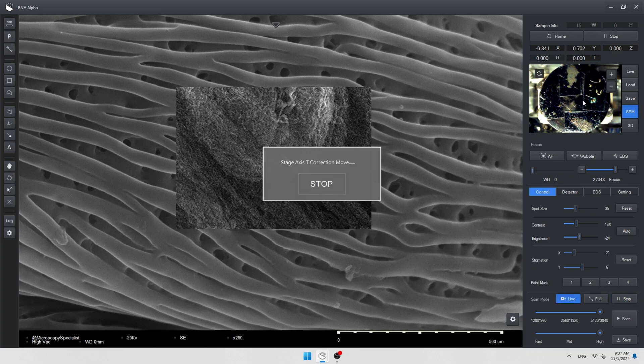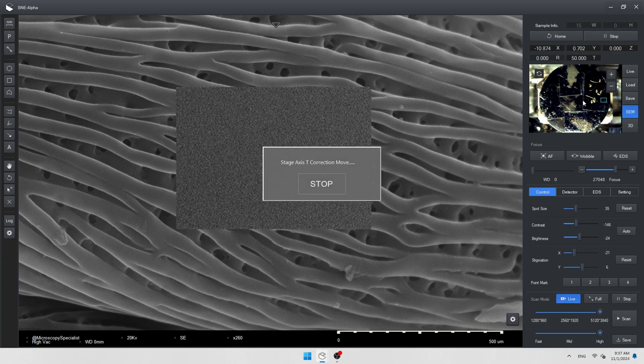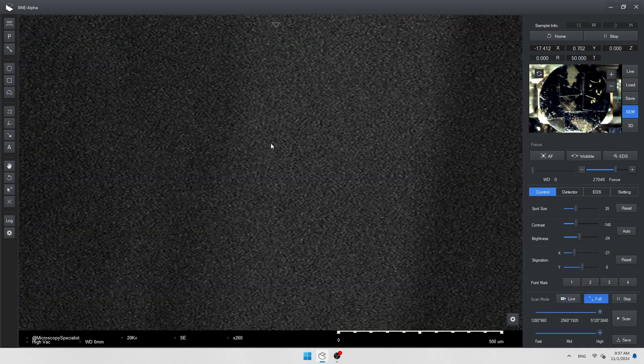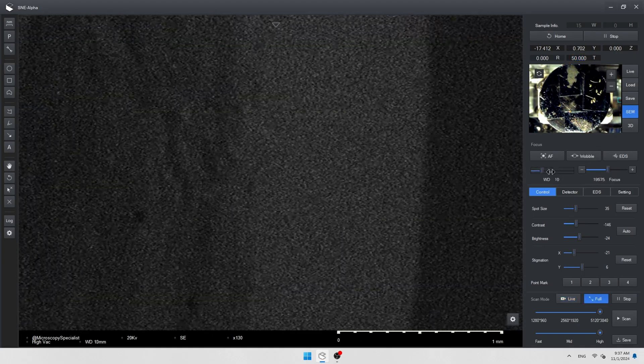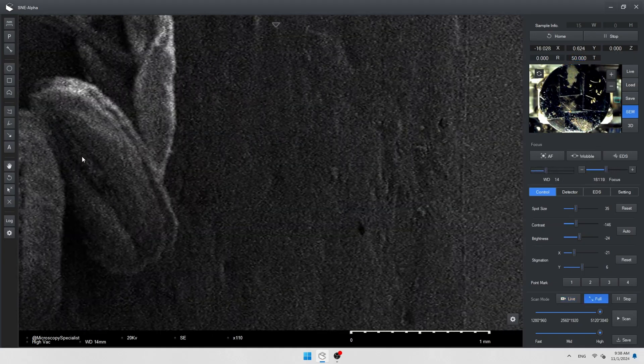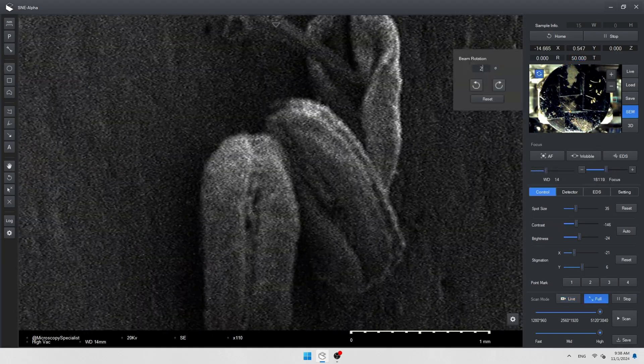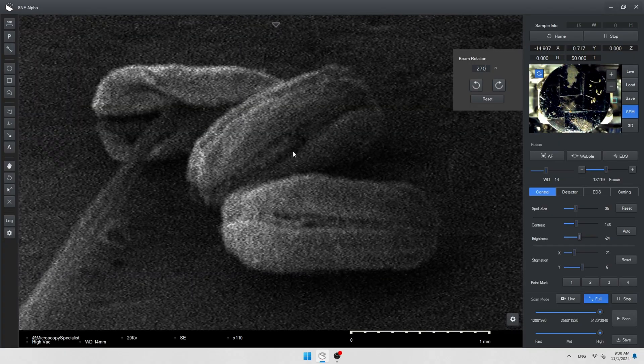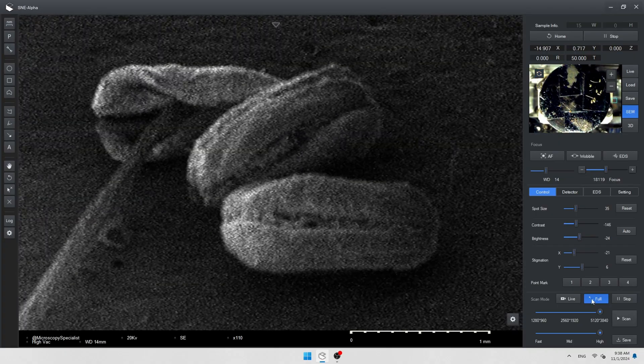Let's add some tilt to the stage and try to find other grains. The microscope will prevent any collisions inside the chamber and automatically apply changes to the working distance and z-position.